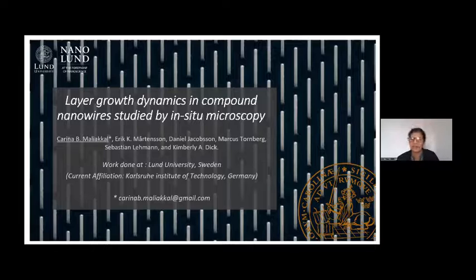And I will tell you a little bit about nanowire growth using a catalyst particle. But let me give a disclaimer at the beginning itself that the usage of the word catalyst might be a little bit unconventional in this context, and I will tell you a little bit more as we go along. So this is going to be about nanowire growth using a catalyst, as I mentioned.